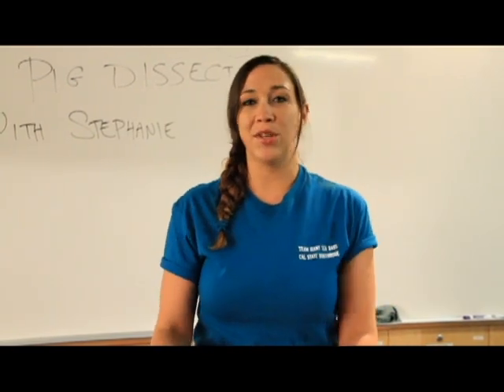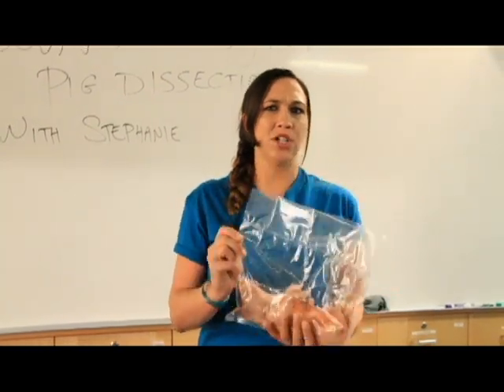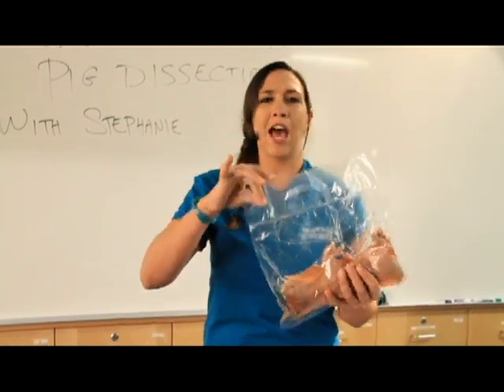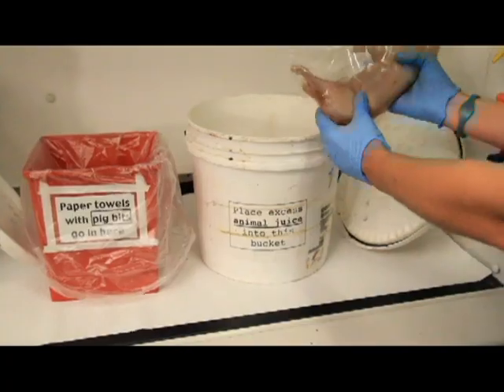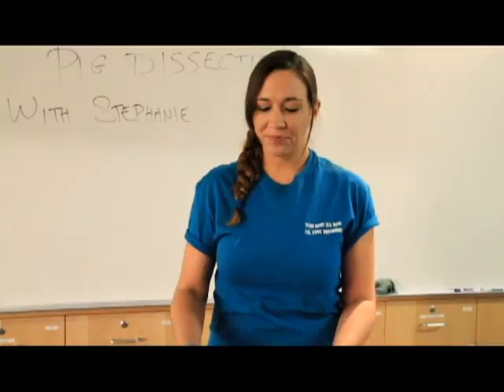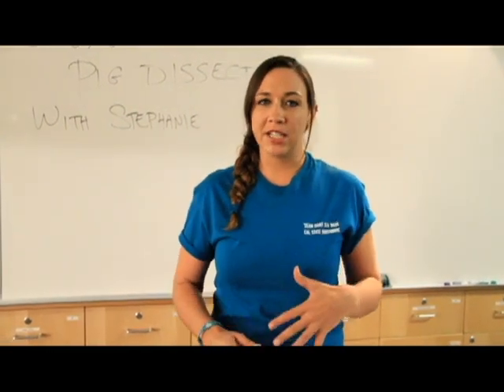Your TA will also give you a little pig in a bag. You'll notice there is some liquid in this bag, so what you want to do first off is cut a little corner and then dump this liquid out into the proper receptacle, meaning the pig juice bin and not the sink. Once you've got your pig and your tray, you're basically going to start using your dissecting tools.